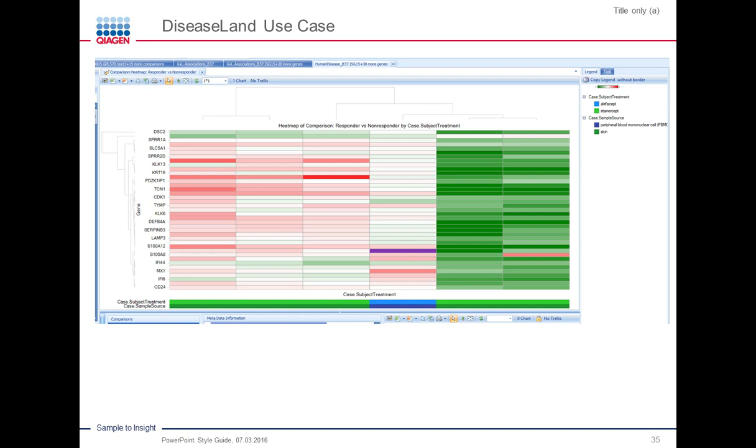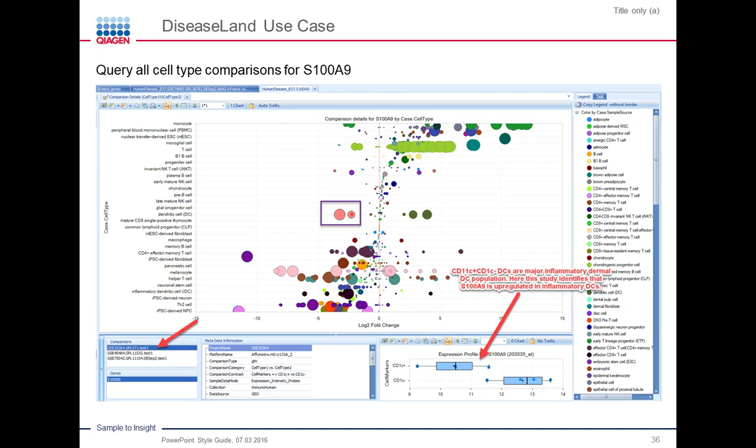And then finally, building off of the fact that we have the different types of data loaded into the platform, we may want to take the same gene signature and ask, how do those genes respond to different treatments? So in this case, I've applied an additional filter into my data where now I'm looking at two different subject-level treatments for two different drugs, and I'm comparing the skin samples versus the PBMC samples, and we can see that to some degree some of these genes, which are normally upregulated in the lesional versus non-lesional comparison, are downregulated upon subject treatment. And we could identify perhaps variability in the responsiveness across the different studies and start to perhaps credential the types of biomarkers which may be predictive of responses.